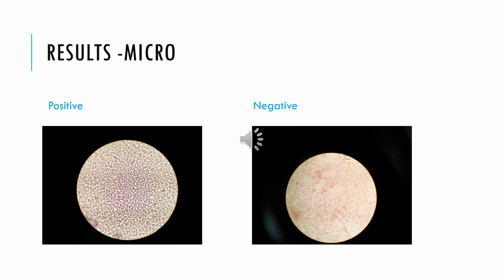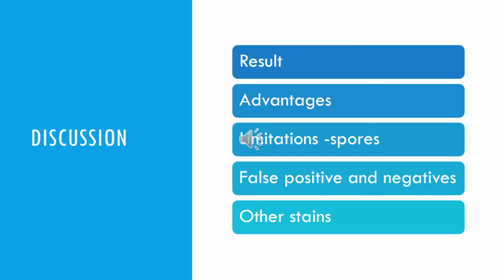Under the microscope, the same will happen. Under the microscope, the morphology can be examined as well as the size and arrangement.